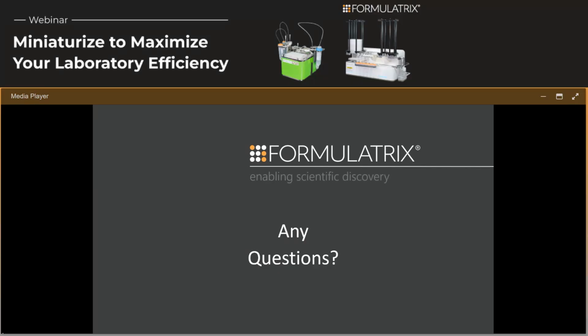Okay, now I would like to answer some questions. And the first question that comes in is, we cannot hand pipette down to very low volumes as the error becomes too large with respect to the total volume. How does the Mantis address this?